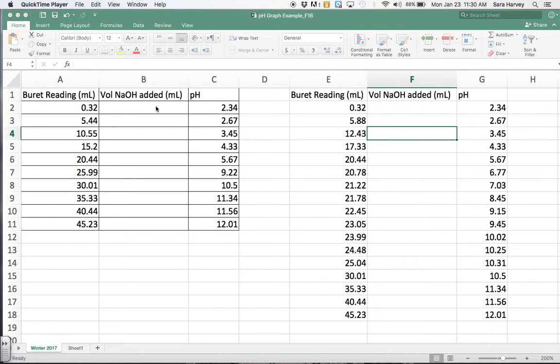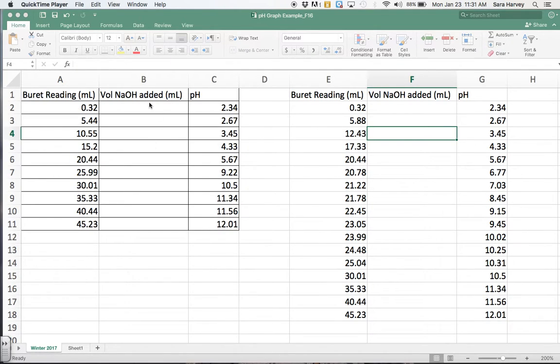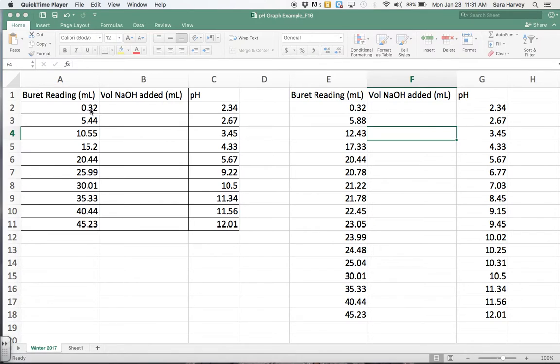The very first thing I want you to do, and what I've done here with data that I made up, is enter the data from your experiment. Notice how in column A I have the buret reading in milliliters. Realize for all of these numbers there are no units. I left column B empty, and that's going to be my column where I have volume of NaOH added.